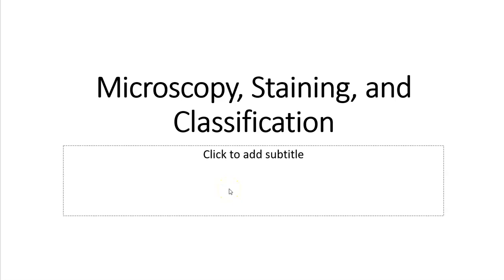Okay, welcome to microscopy. Hopefully you guys have gone through the little tools of the lab and some lab safety. I didn't record anything because you can read that for yourself, and I have little YouTubes for you to watch. But I did want to go through microscopy and staining and classification with you. Hopefully, this will go along with some of the prokaryotic cell lecture that I've done.